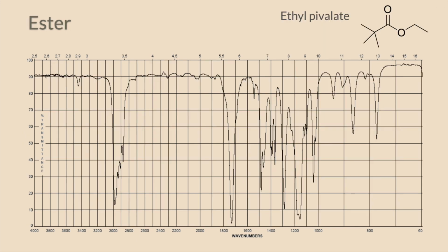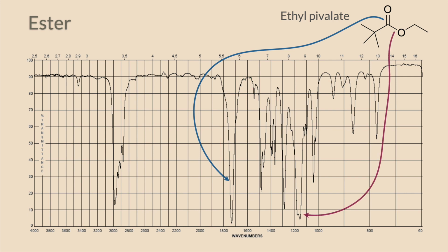Then the ester. So again, just like alcohol and ether, the OH stretching is gone. Here also there is no more OH stretching in that region. So we have the usual carbonyl group in the same region, and also we can sometimes identify this peak, which is sharp and also very prominent, that is the carbon-oxygen peak over there.